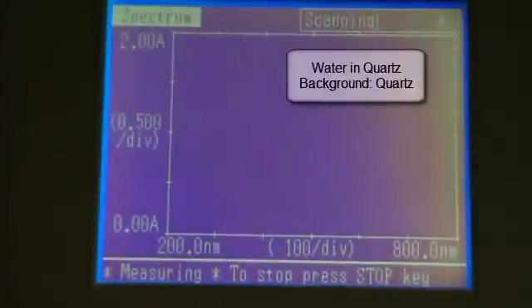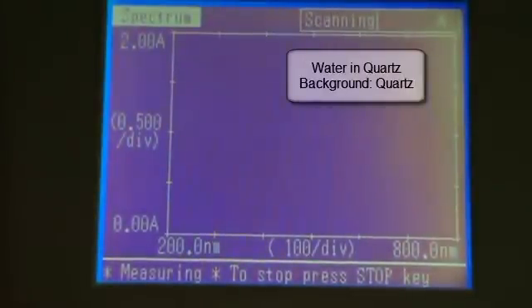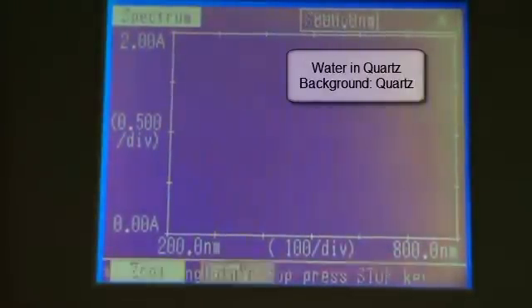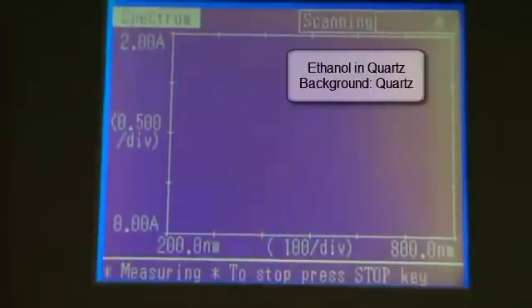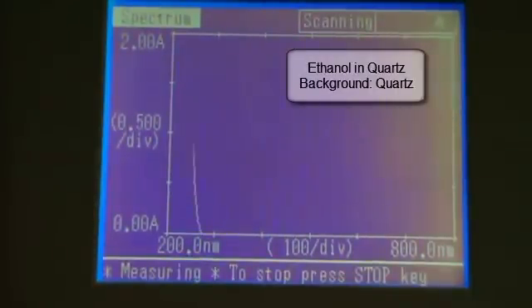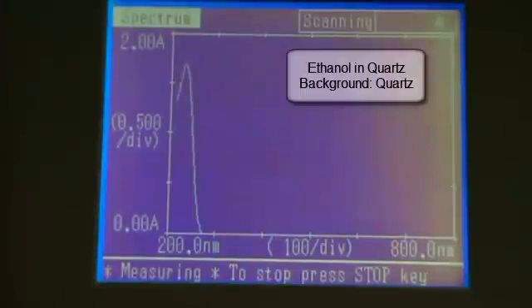Now let's look at some solvents. First up is water. Water doesn't absorb at all in the UV visible region, so it's ideal along with quartz cells for samples that absorb in the UV, once they are soluble.